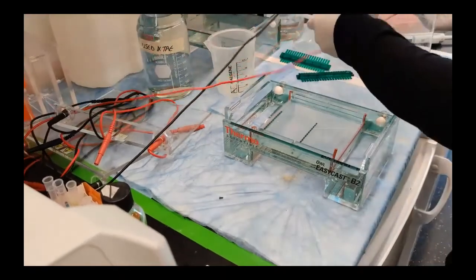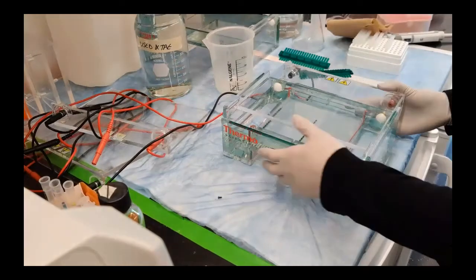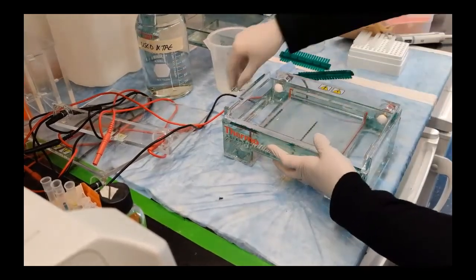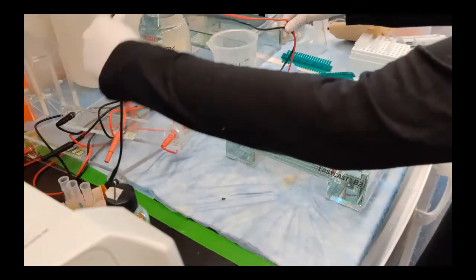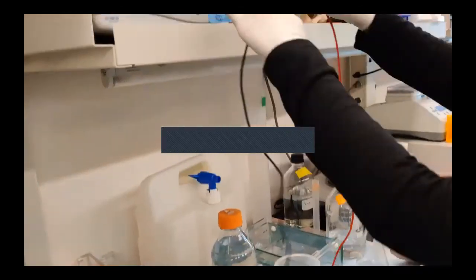And all we have to do now is connect the tank to the machine and you can see here there are the negative and the positive electrodes. And off we go!